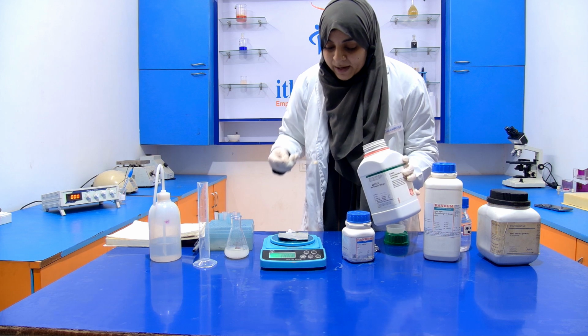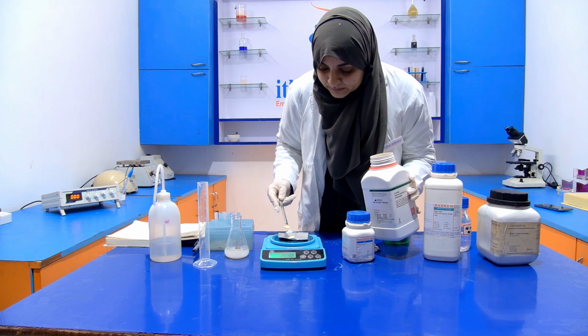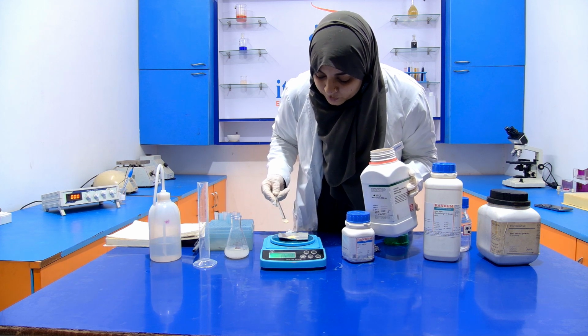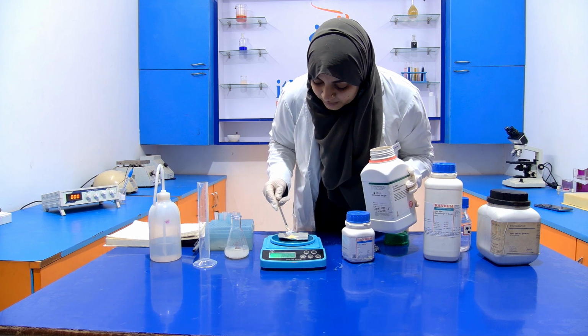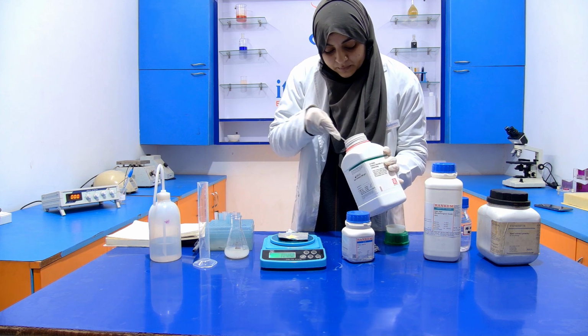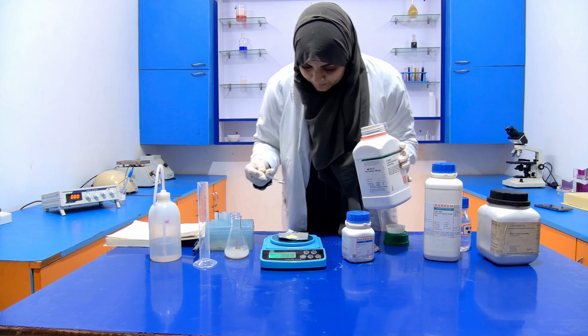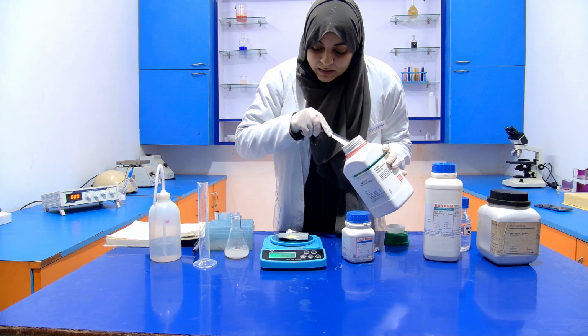So we have to add it very carefully because the weight is very less. 0.29, 0.44, 0.45, 0.49.